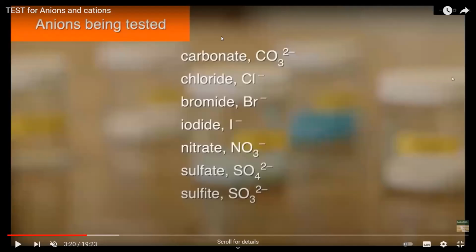So in this video, we'll discuss how we can test the carbonate ion. If you want to test a carbonate ion, we add acid. Any acid can be added. If you want to test chloride, bromide or iodide, first we add acid, normally nitric acid, HNO3, followed by either silver nitrate or lead nitrate.